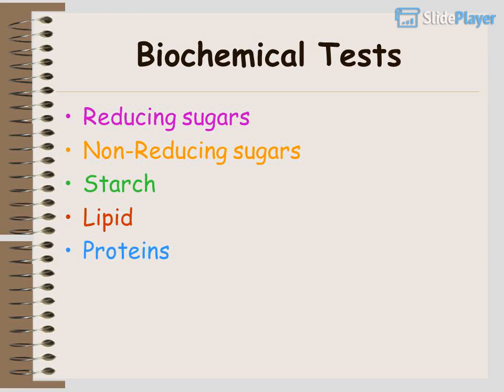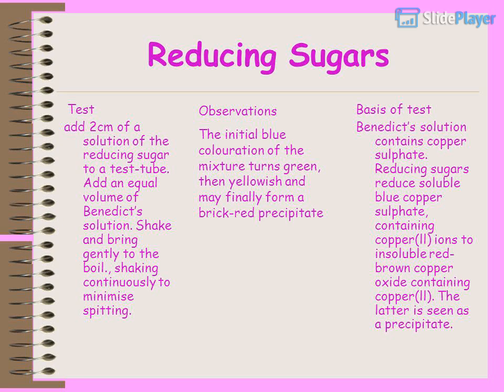Biochemical tests: reducing sugars, non-reducing sugars, starch, lipid, proteins. Reducing sugars test. Add 2 cm³ of a solution of the reducing sugar to a test tube.